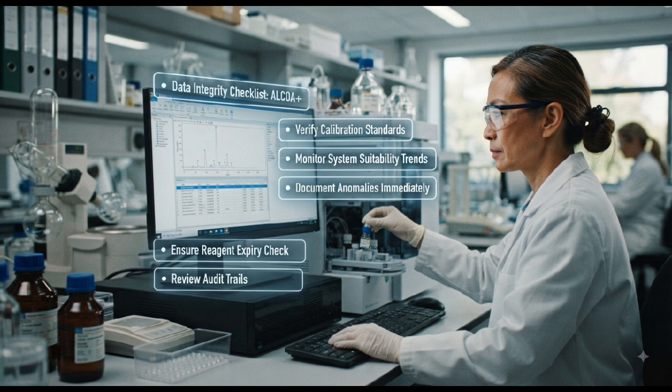Do not round values before performing calculations unless the procedure specifies rounding. Do not change acceptance criteria based on the observed result. Do not hide failed results, and always maintain complete traceability from the reference standard to the final calibration report.